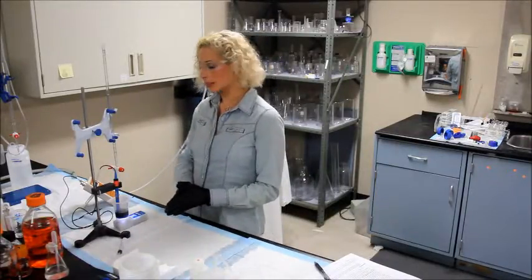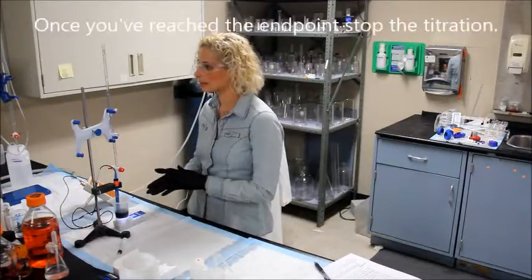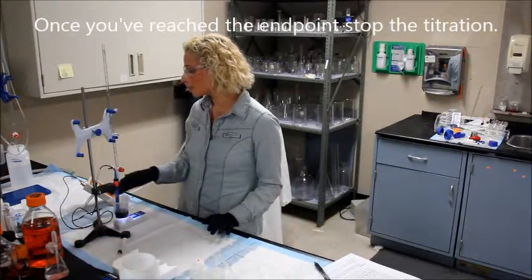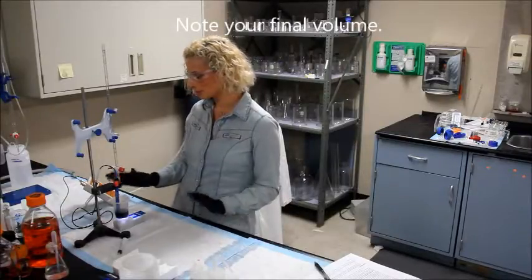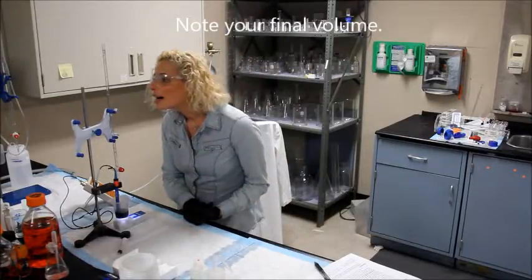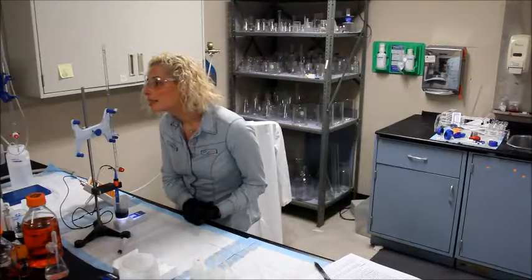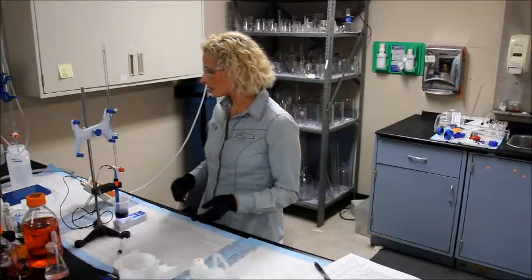The solution has reached 8.2 again, the instrument has started signaling, and I will note my final volume. The burette has stopped but it still reads 8.2 on the instrument. My final volume is 3.34.